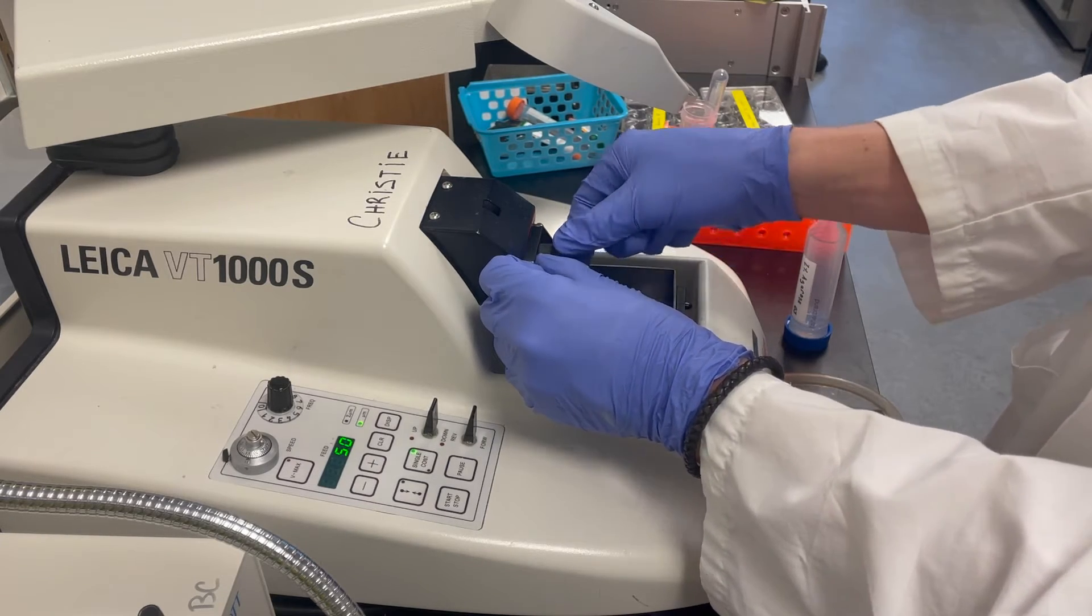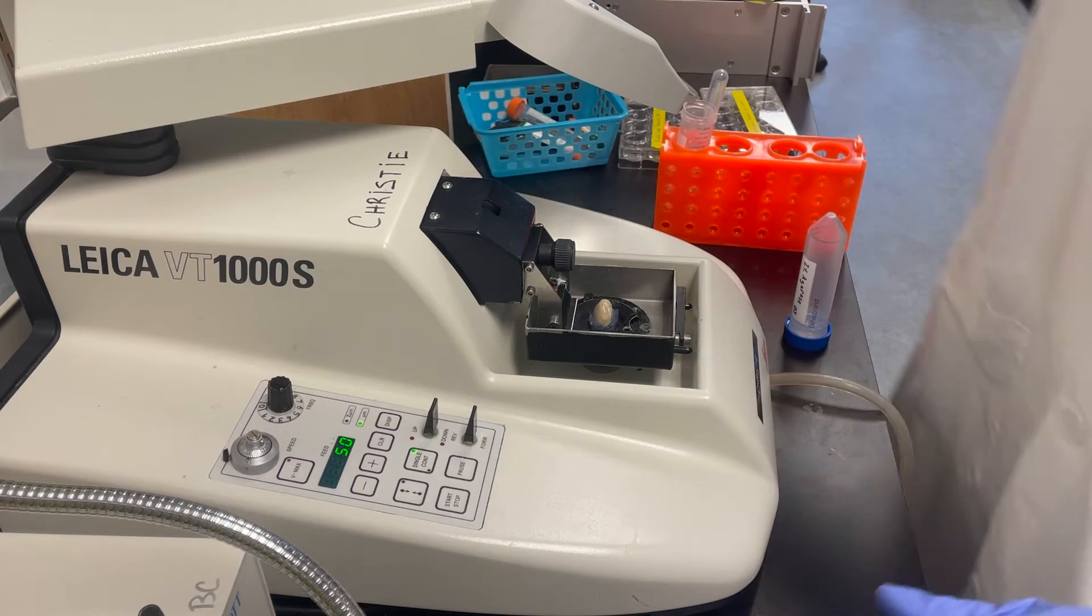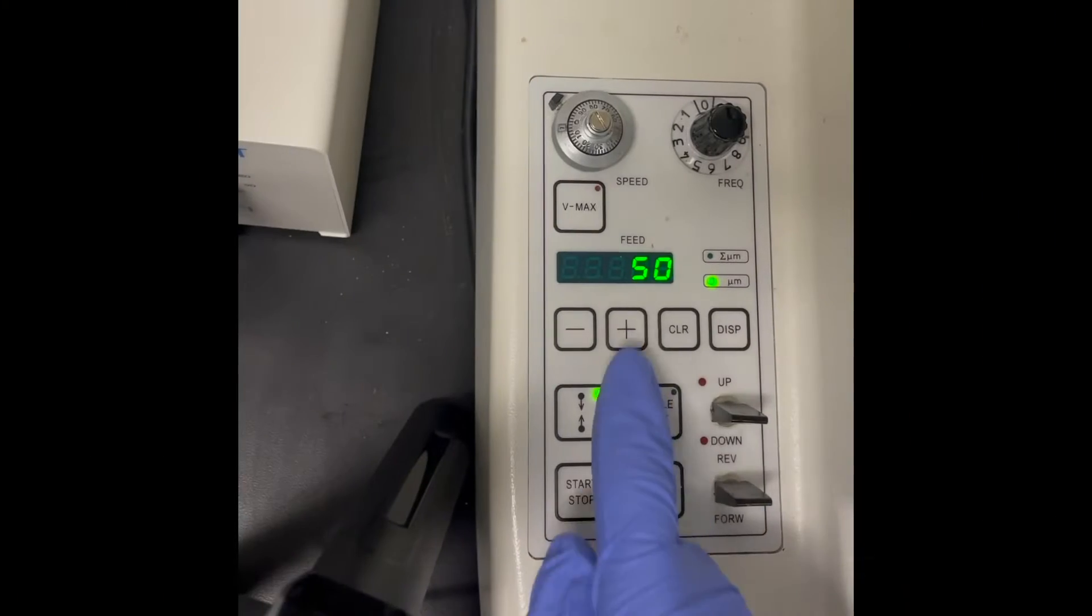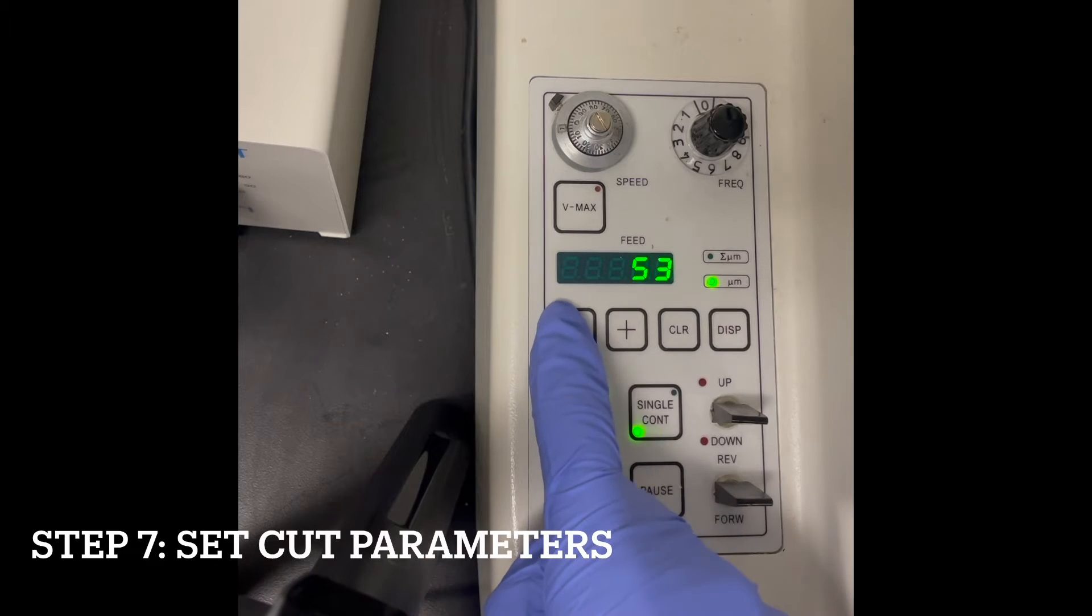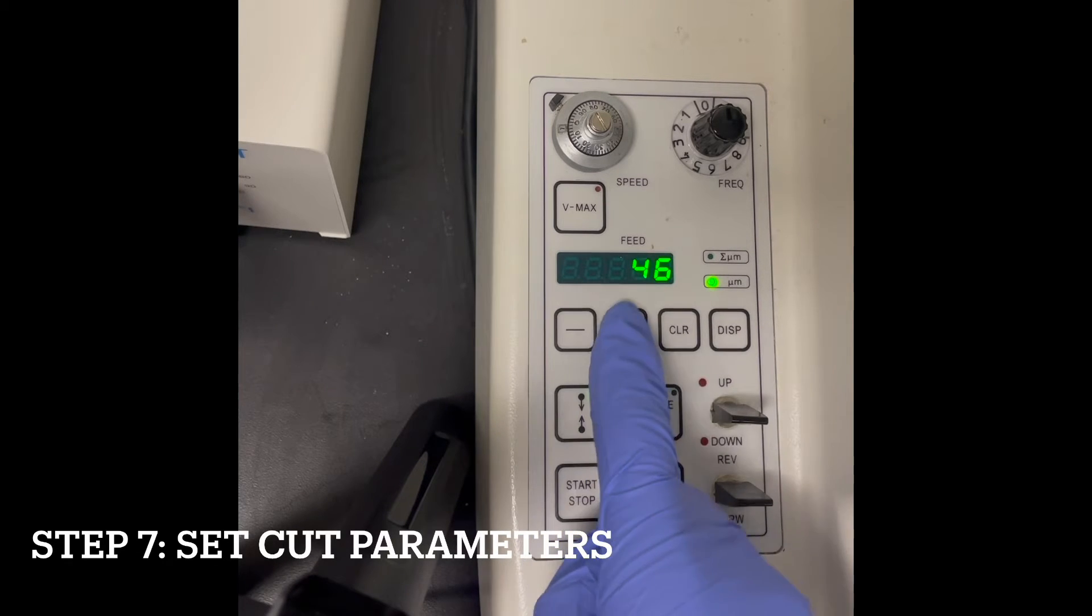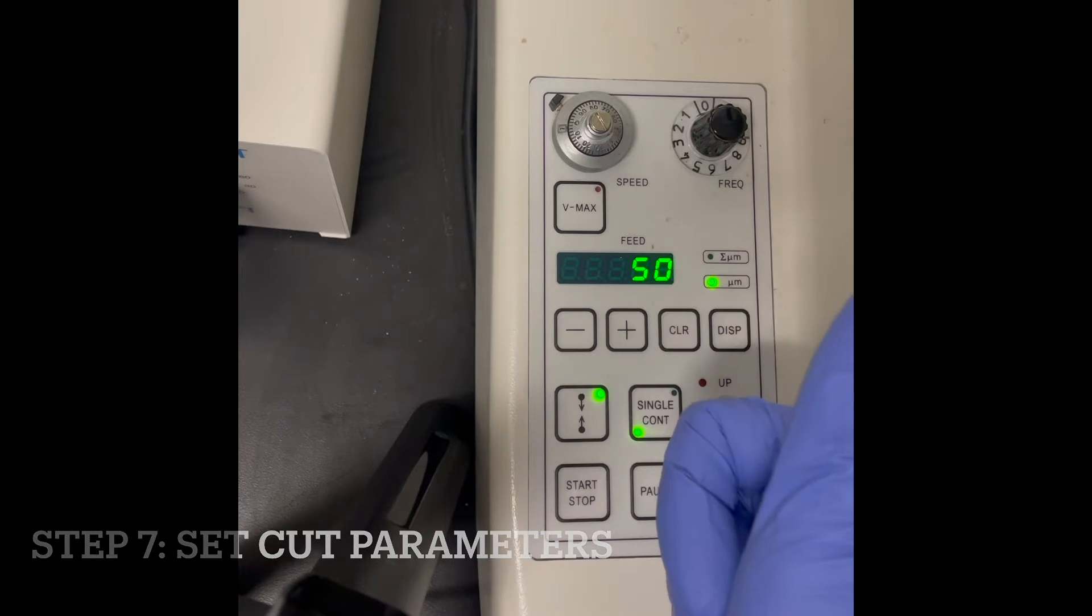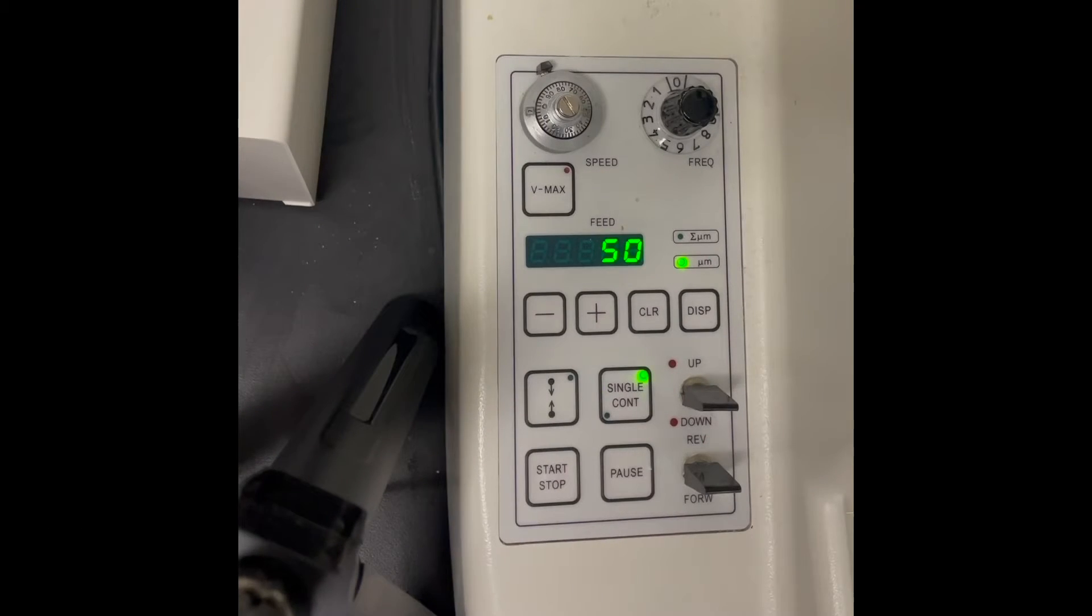Next, we're going to adjust the settings on the machine to fit the ideal parameters. First, we'll take a look at the slice thickness, which can be adjusted using the plus and minus buttons. For our protocol, we use 50 micrometer thick slices.